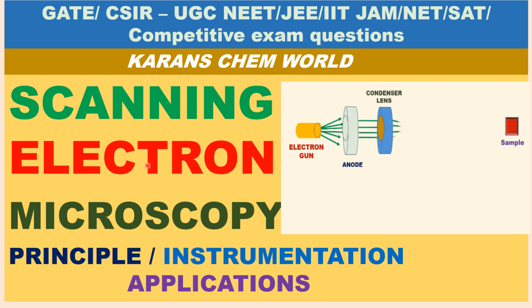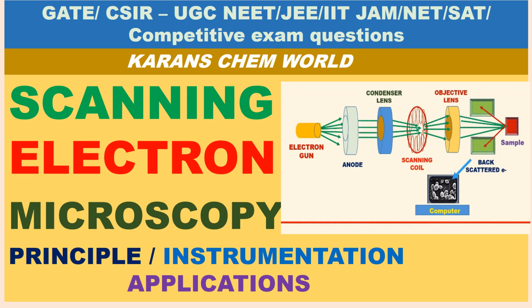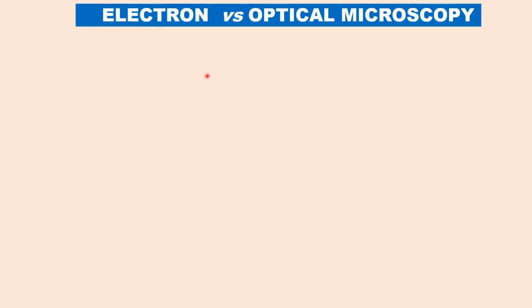In this video, let us learn scanning electron microscopy and its principle, instrumentation, and applications. Before we study SEM, let us compare electron versus optical microscopy.